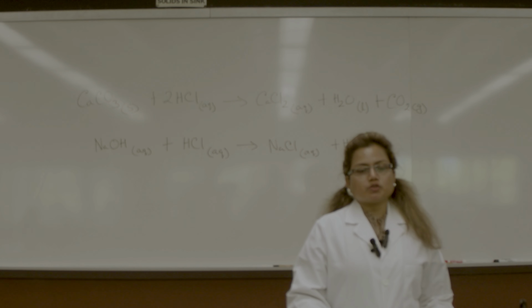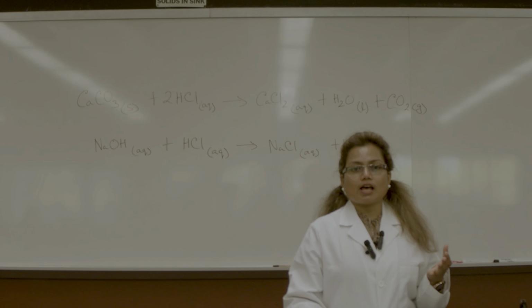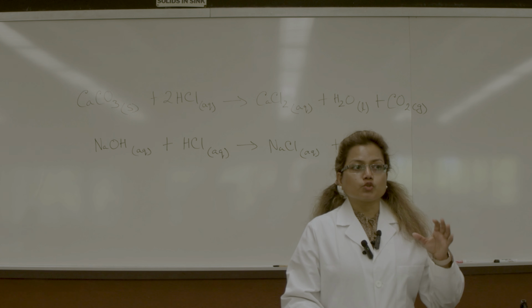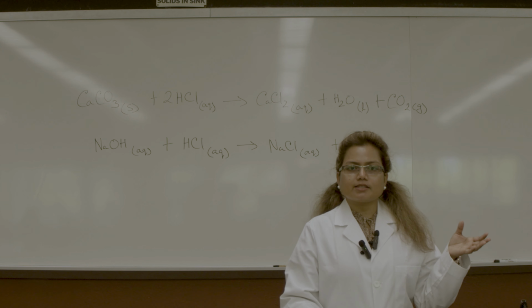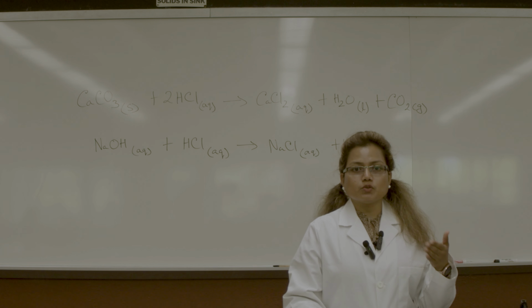We use antacid when we eat oily food, because sometimes we have more than the normal quantity of acid produced in our stomach. To neutralize this acid, we use antacid from CVS or somewhere. You can use Tums, which is what we use as antacid.